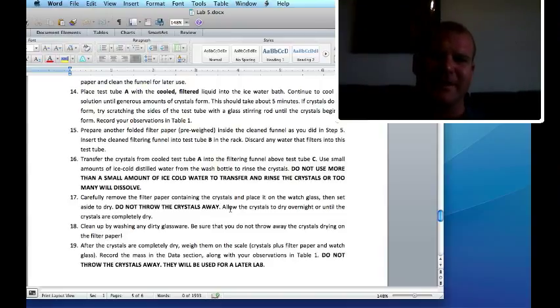It's kind of cool when it crystallizes. It looks kind of like snow. It's white powdery stuff. That's the aspirin. So scratch it, and the white powdery stuff will eventually form. Let it sit for a while, rather than just stopping when you see some. Let it sit so the crystals will grow and you get more out.